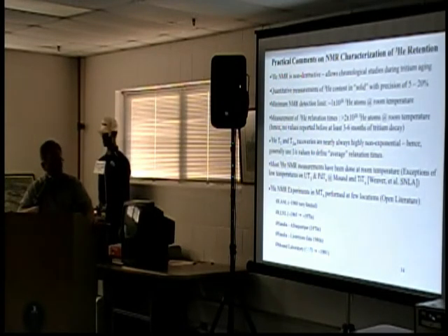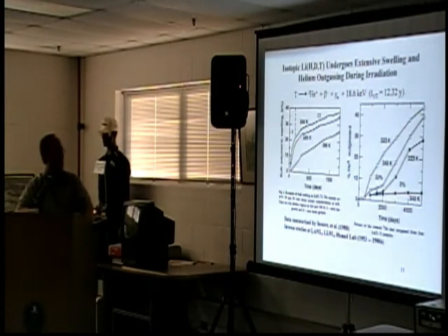And then we at Mound started in 73 doing measurements and actually ran up to just about before Mound closed with George. And so somewhere around 1990, 1991 was the end of NMR of metal hydrides, or any tritium or helium-3 measurements that I know of at Mound. I don't know when the spectrometer disappeared, but it was sometime after that. Okay, done. Now, this is an example of the lithium, hydrogen, deuterium, tritium.